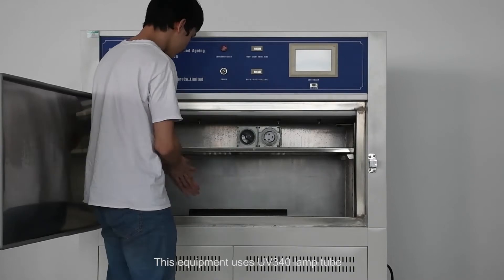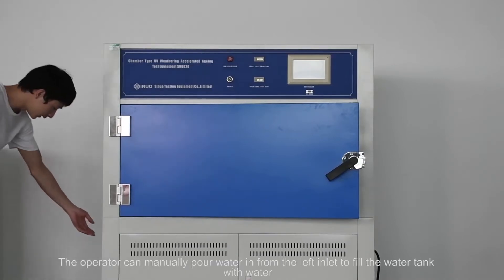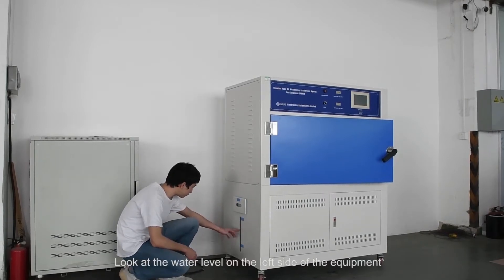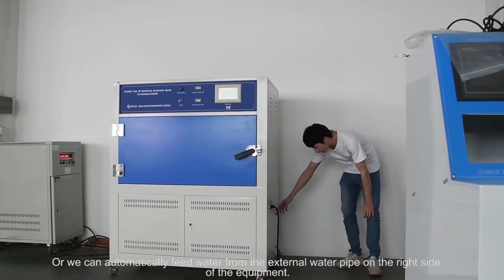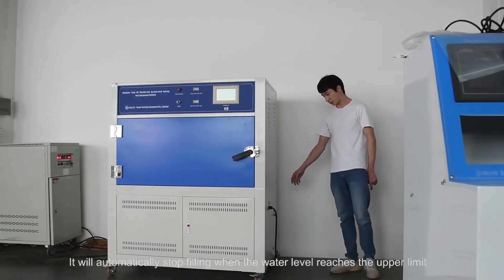This equipment uses a UV-340 lamp. The operator can manually pour water in from the left inlet to fill the water tank. You can check the water level on the left side of the equipment, or automatically feed water from the external water pipe on the right side of the equipment.